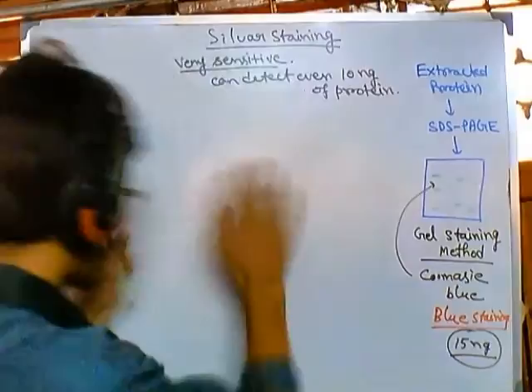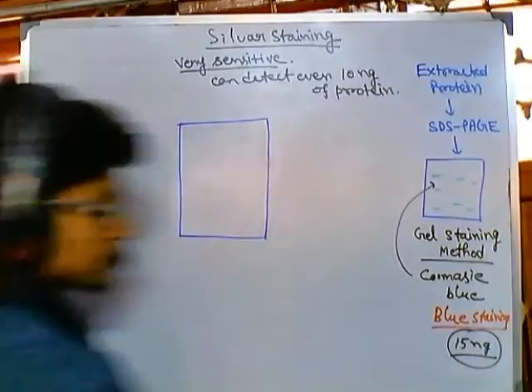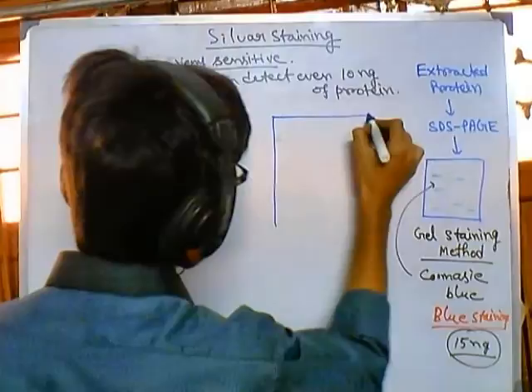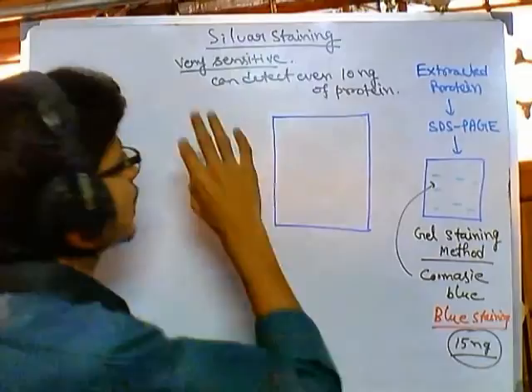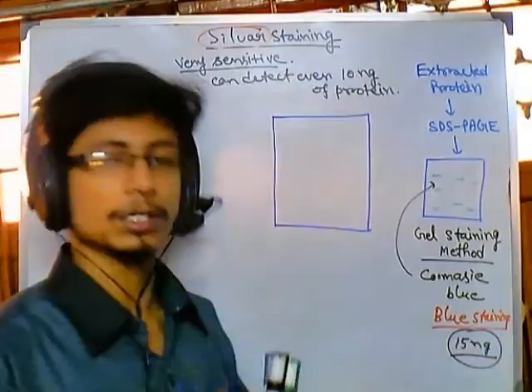In all this, we get a gel in our hand, right? Let me draw this gel somewhere. Let's say this is the gel. We get our gel and there are proteins, but we don't know where the proteins are actually present, right? We need to stain to visualize the presence of the protein. For this silver staining, as the term suggests, it utilizes silver as the depositor to denote the presence of the proteins, right?